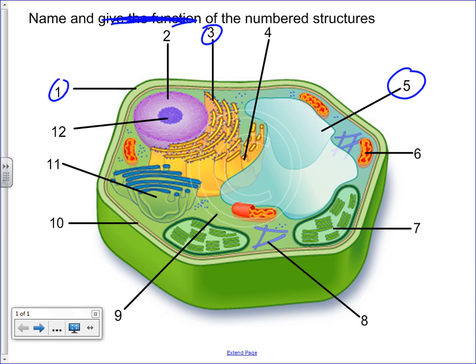Number 5, I would also like number 6, 7, 9, what am I at here? 1, 2, 3, 4, 5, 6, 7, and 8. All right, so I want all of those identified. And then your last question is, what kind of cell is this? Questions? Only the circled ones.